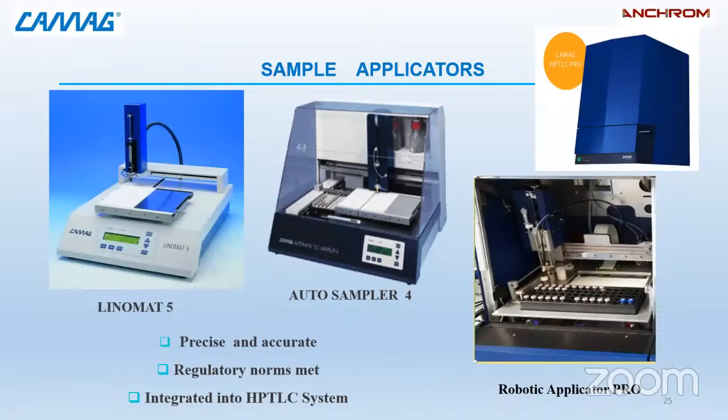After sample preparation, we can go for sample application. Majorly, we have these 2 options available. I will not talk about Pro, and this one is the automatic applicator. Both these instruments work on the spray-on technique. That means nitrogen or air is required for the application. What happens is your sample gets mixed with the nitrogen or air, and it is converted into a fine mist, and this mist is sprayed onto the plate in the form of thin, sharp bands.